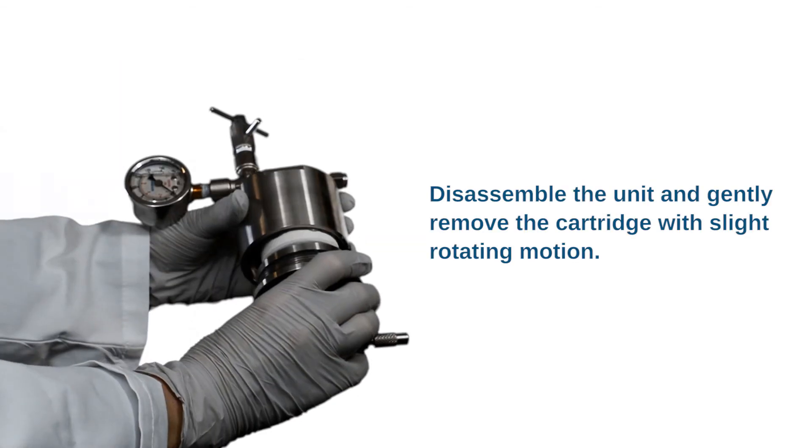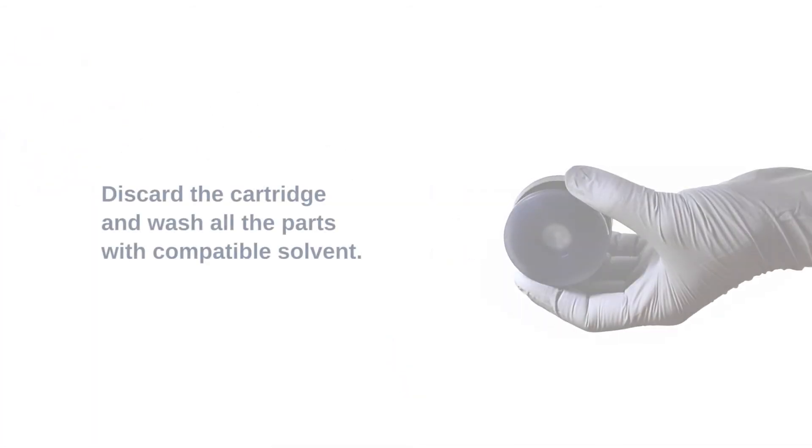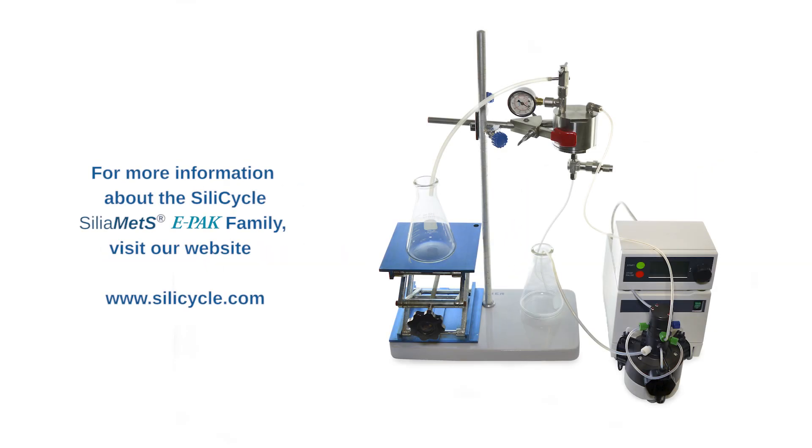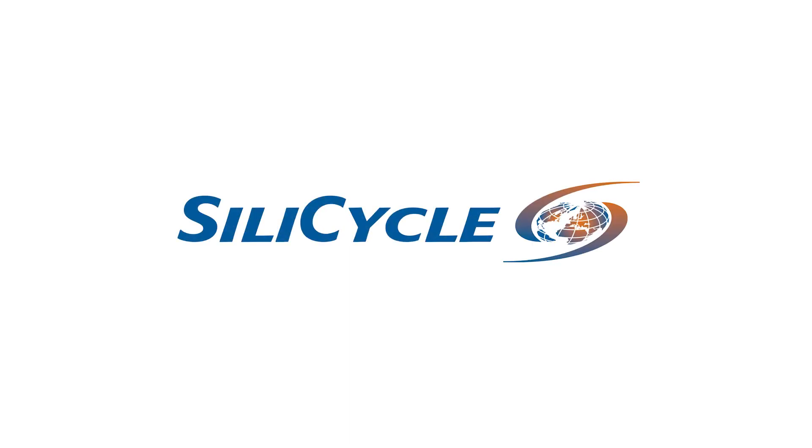Disassemble the unit and gently remove the cartridge with a slight rotating motion. Discard the cartridge and wash all the parts with compatible solvent. For more information about the SiliCycle SiliaMet E-PAK family, visit our website at silicycle.com. Thank you.